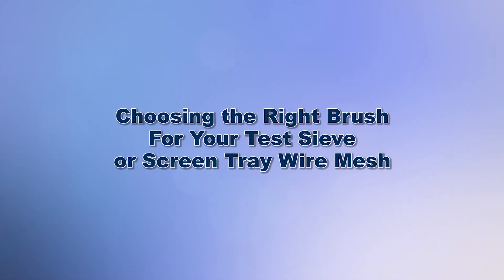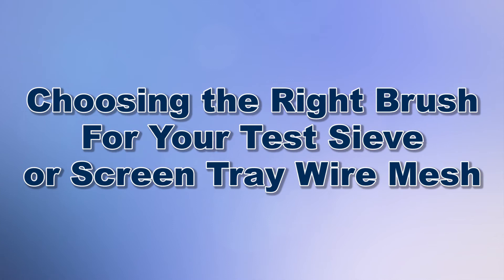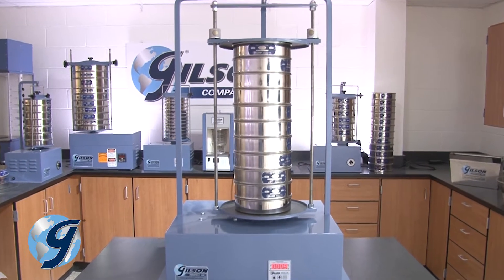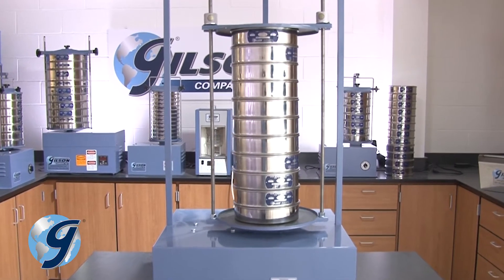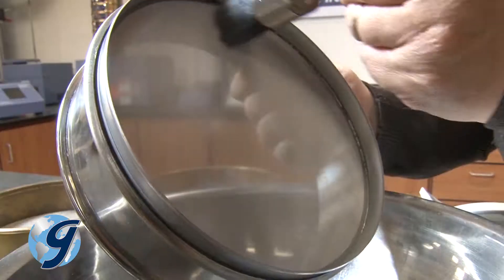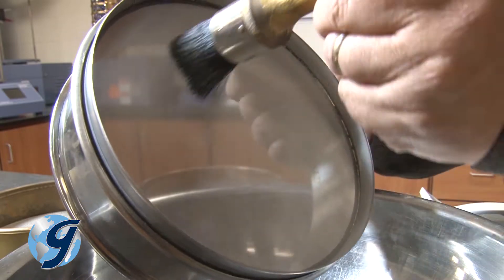Test sieves are precision instruments and, if handled with care, will retain their accuracy and have a long service life. Keeping your test sieve and screen tray mesh in good working order requires using the right brush to thoroughly clean the mesh without causing damage.